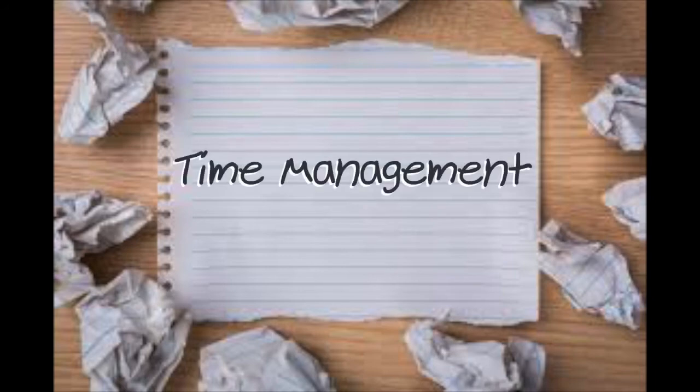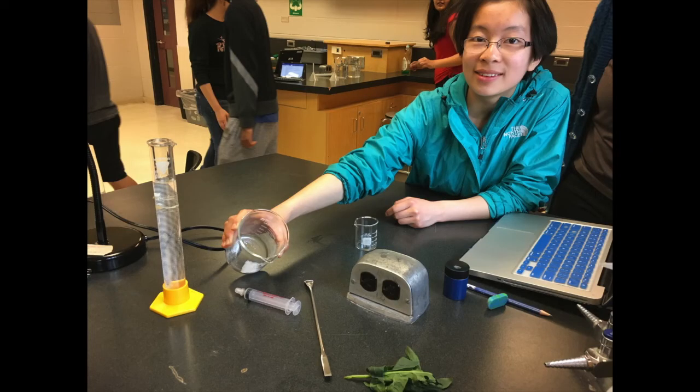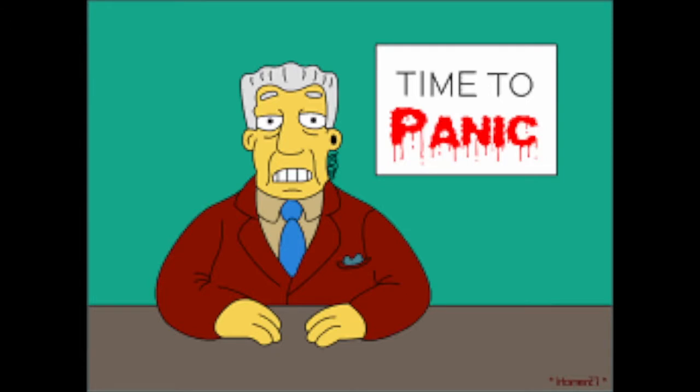Challenges of a self-made lab. One challenge we faced by creating our own lab was time management. We created the lab and we made our procedure super intricate to make sure that the results that we get are what we want. As we actually went through with the lab, we realized that we didn't really take in how much time the lab and lab prep actually needed.